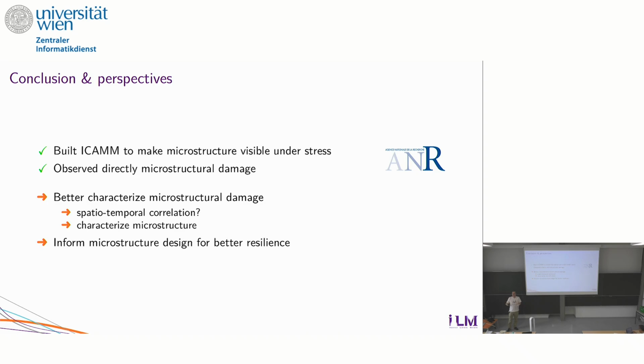Can we use the kind of topological observable that Safar defined two days ago, this in-betweenness centrality, for example? Is it important there, or is it something more geometric about the local orientation of the microstructure with respect to the principal elongation axis? So that's a lot of questions I would like to answer. Maybe you have plenty of those, so please, I'm open to all those questions, if we get more funding to continue this story.